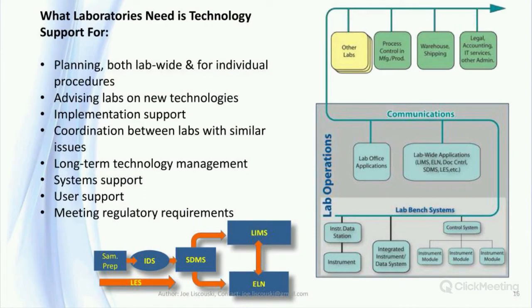The lab's dependence upon manual methods is giving way to facilities that carry out their work smoothly, with high productivity levels and a return on investment. That usually means automation, implemented where appropriate, with support staff equal to the job.